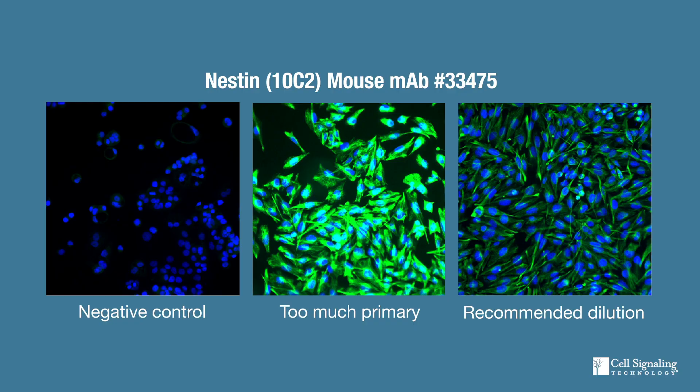If your negative control slide looks clean, but you're seeing too much signal in your experimental samples, you may have used too much antibody. It is possible to get too much signal when excess antibody is used, so make sure to titrate your antibodies appropriately, or use the recommended dilution found on the product page.